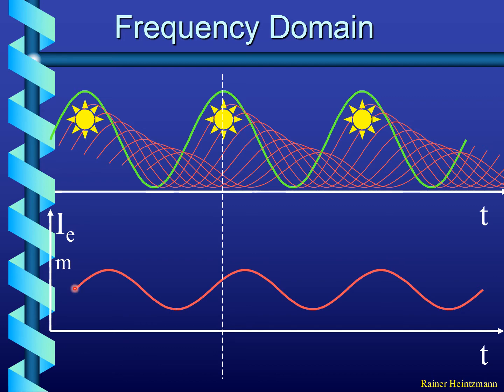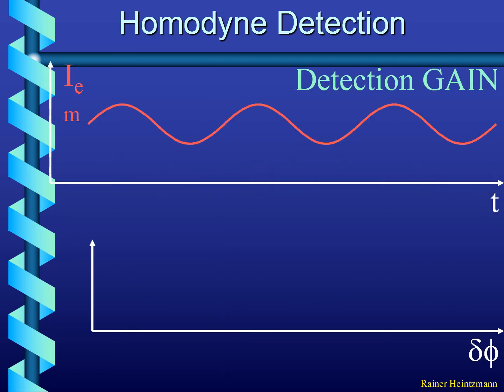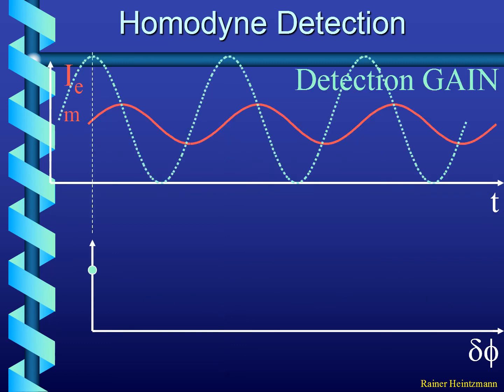It is a curve that is still a sinusoid, because it turns out whatever sine curve you add to a second sine curve, it will just modulate the amplitude and the phase, right? If the second curve is the same, then the amplitude is double and the phase is still the same as before. If the phase shift is, for example, exactly pi relative to this, you would get an amplitude of 0, and if it's slightly less than pi, you get a pretty big phase shift of pi half in this case, and so on. So what you get is this modulated curve, and you can characterize this curve by two things.